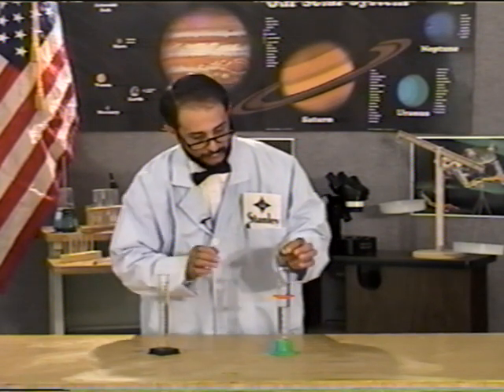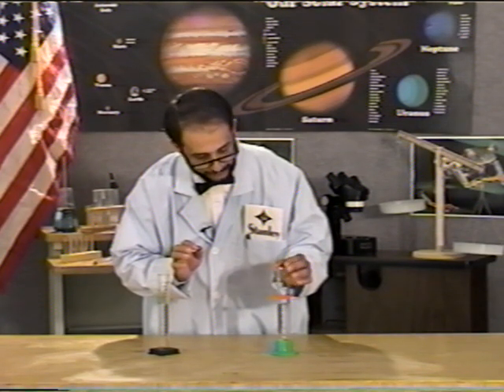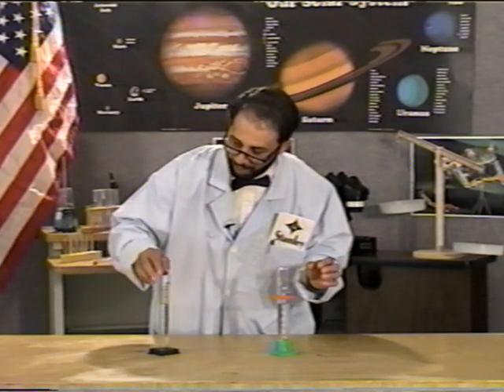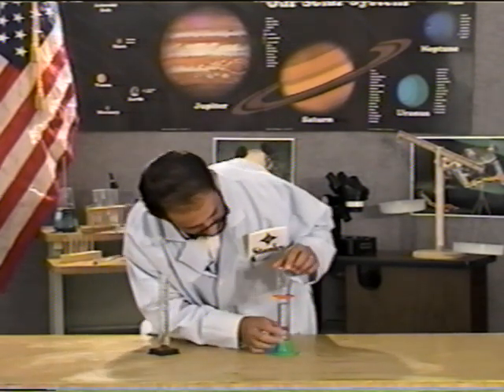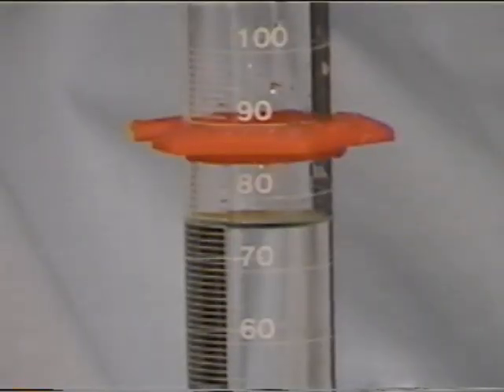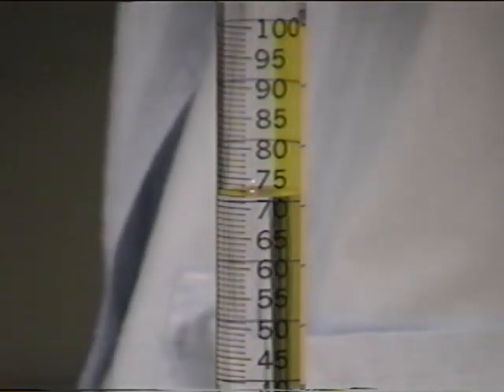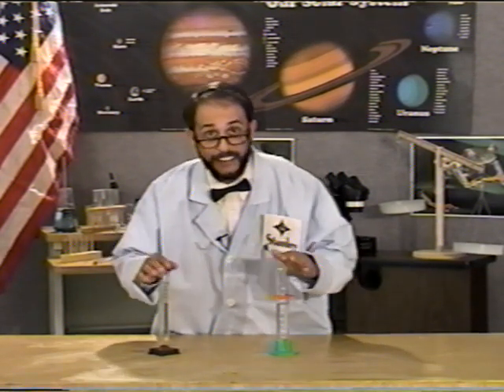Well, let's take a look here. We'll drop this large marble into 70 milliliters of water, and we'll drop this small marble into 70 milliliters of water, and we'll see what those 70 milliliters become. On this one, our 70 milliliters has become 76 milliliters, and on this one, our 70 milliliters has become a mere 71 milliliters. There you have it, a more accurate demonstration and measurement of volume than just looking at it with your eyes.